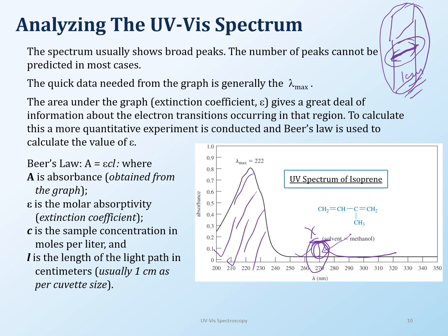And I want you to imagine one thing about what I'm talking about here. If you go to the beach and look out in the ocean, you're going to see different shades of blue. Okay, and that's because there are different numbers of ions in there, and there's also different depth. Even if the ions were the same, the different depth of the ocean will give you different colors, which means how much light is passing through in that distance will change the color of something. And that's why it's really important for us to keep the 1 centimeter.